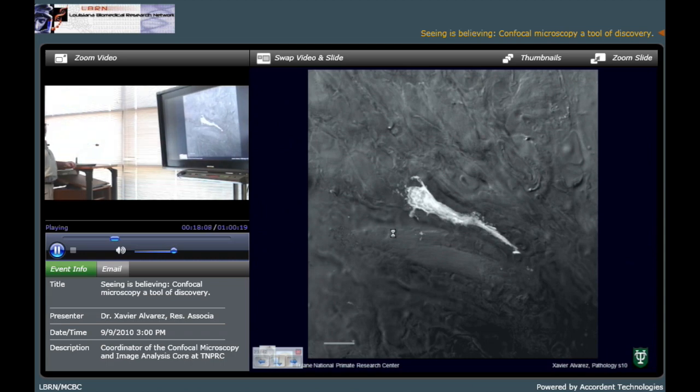Doesn't want to come. Oh, but anyway, if the movie doesn't work, you could always project all the information that you have into two dimensions again. Then we have in that piece of tissue a cell, and with the movie it is more impressive because you could see where this thing is inside the cell. What is that feature in the cell? Nucleus. Very good. Who said that?